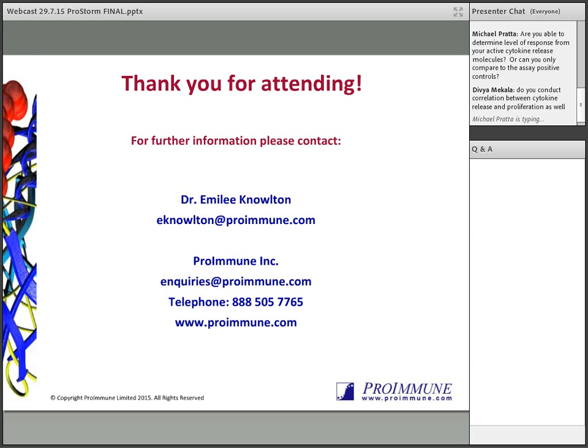Okay, so this next question, the assay uses a soluble format. Yes, that's correct. Several reports indicate that the molecule must be immobilized in order to give a cytokine response. Can I comment? Yes, we certainly appreciate that there are several different formats of assays to test cytokine release, soluble versus immobilized, whole blood versus PBMCs. And really, I think it probably comes down to the particular drug itself.